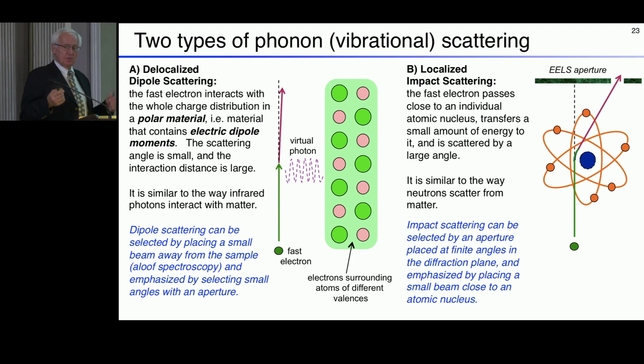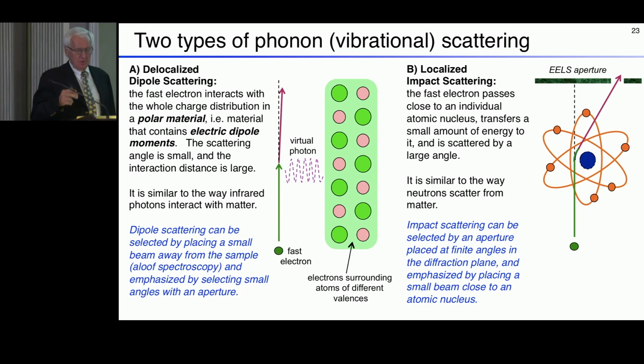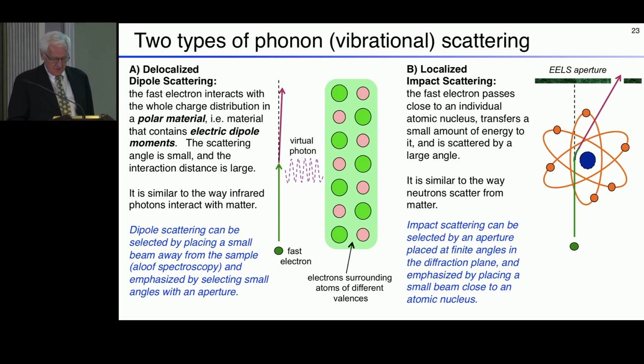There's a delocalization at this kind of energy exchange. It really comes back down to delta E, delta T has to be greater than h bar. So the uncertainty principle, and we can probe the sample without irradiating it, which is wonderful for minimizing radiation damage. It does cost you resolution. We will not get atomic resolution with that kind of a signal.